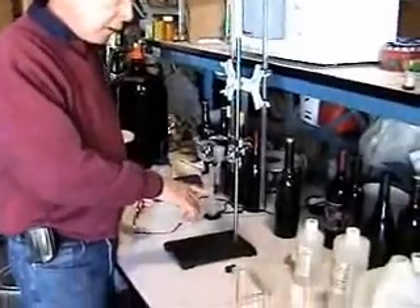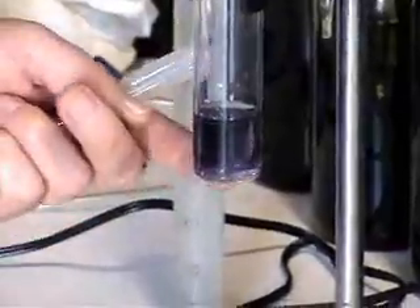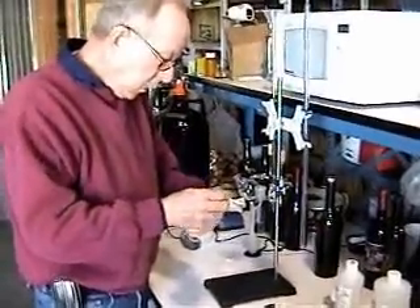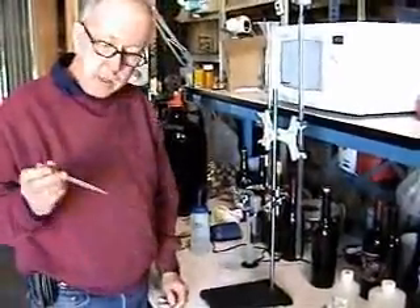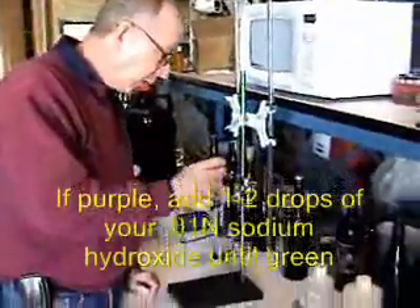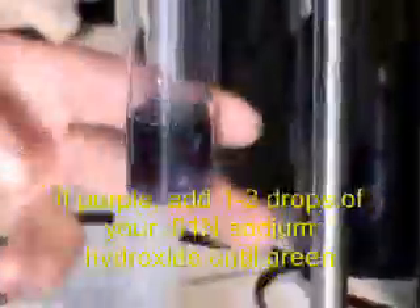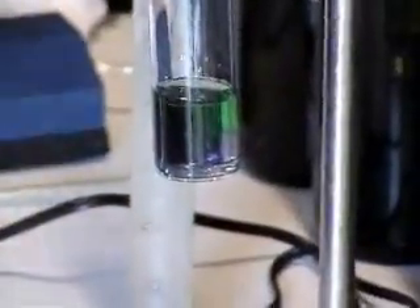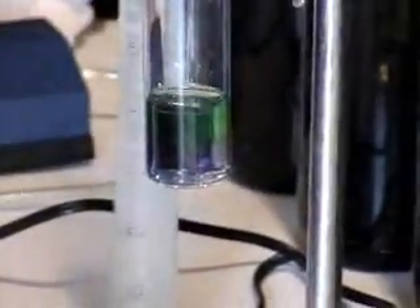As you can see, when I put the indicator in with the peroxide, it did come out on the purplish side rather than green. So we're going to transform it into green. The way you do this is you take sodium hydroxide — you don't need very much. I think only one drop will turn it back to green. And then we're back to the green color that you want to have.